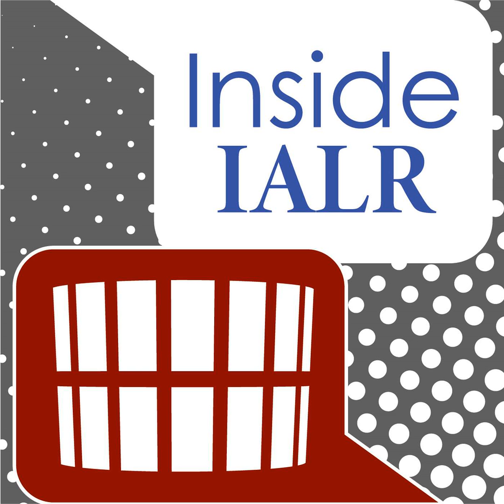So the main thing I wanted to talk to you about today is our plant imaging platforms that you have helped run for, I think, 10 years at this point. So tell us a little bit about, I know they're called smart platforms. We love acronyms here. Tell us what a smart platform is.